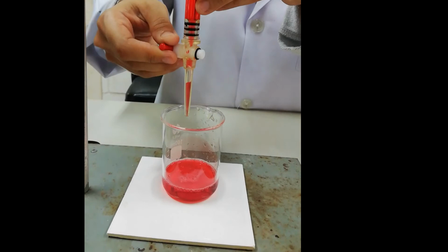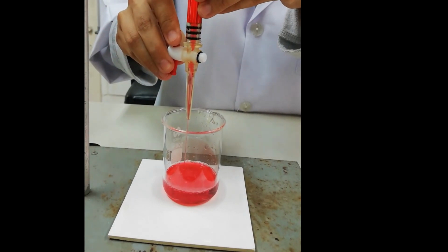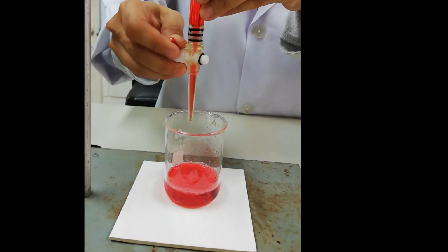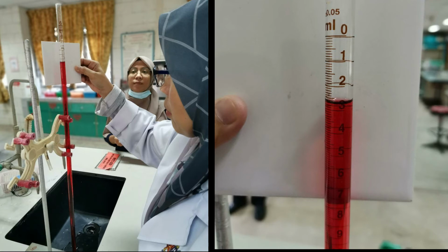Turn the stopcock to allow the solution to flow through the tip of the burette. Turn the stopcock all the way and let the solution push the bubbles out. Once the air bubbles have been removed, the burette is ready for titration. Now, record the initial reading at the top of the burette.